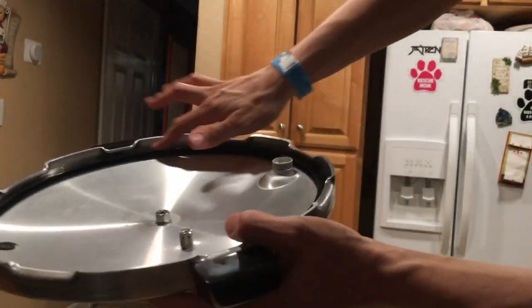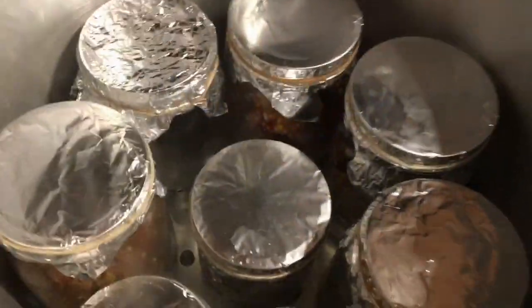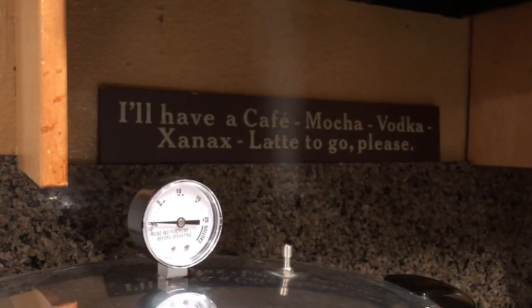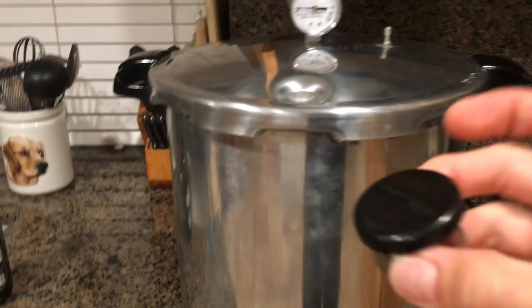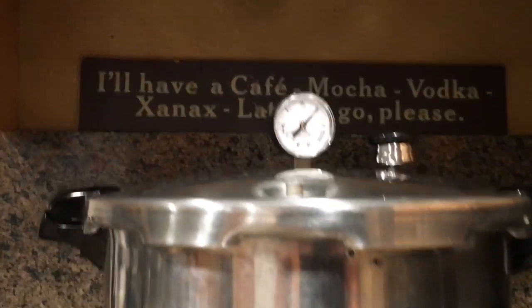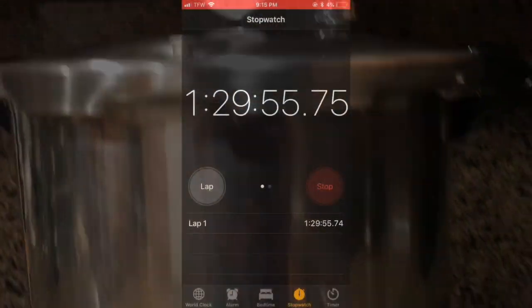Grab some oil and lube up your seal. Turn on your burner and put it on high. Once you start seeing steam, go ahead and close your lid. Allow steam to build up — once you see steam, wait another 10 minutes. After 10 minutes has passed, put your weight on your pressure cooker. Allow the pressure to build up to 15 psi, adjusting your burner as needed. You will be pressure cooking at 15 psi for 90 minutes. Once your hour and 30 minutes is up, turn off the burner and let it cool overnight.